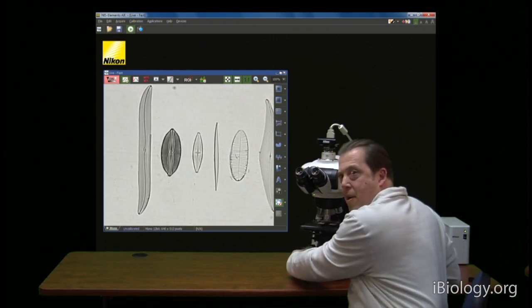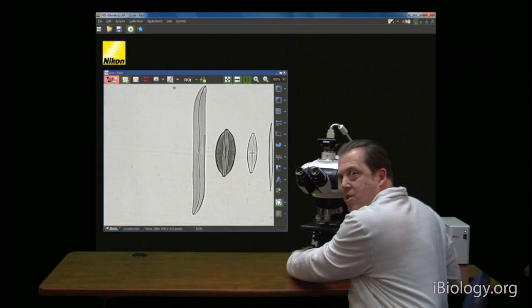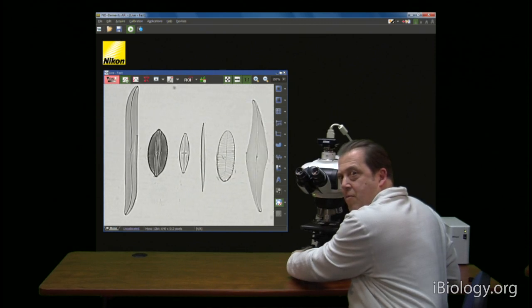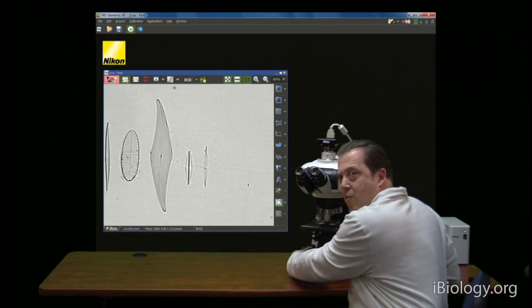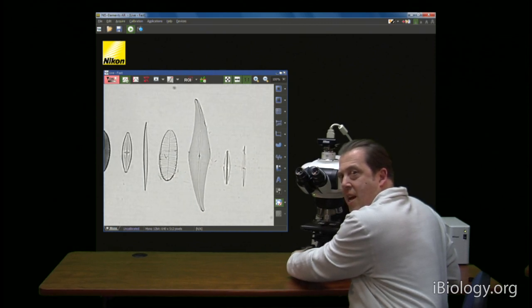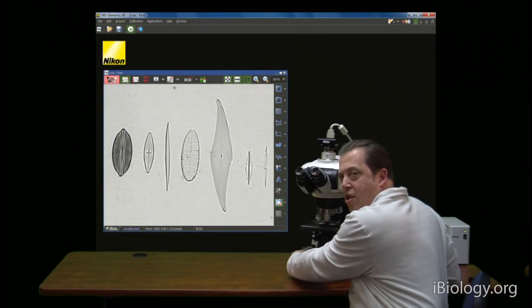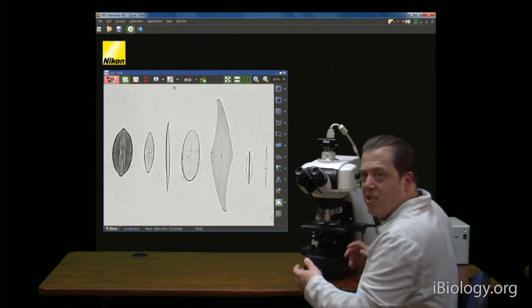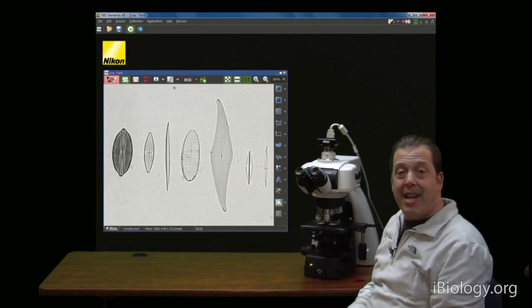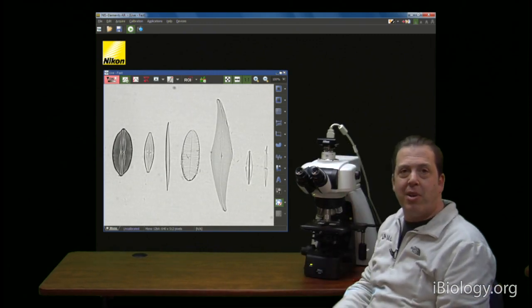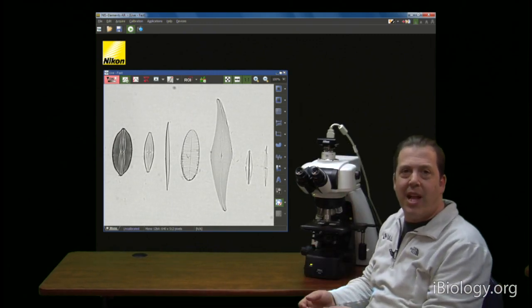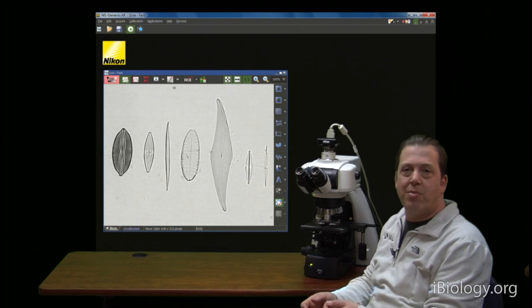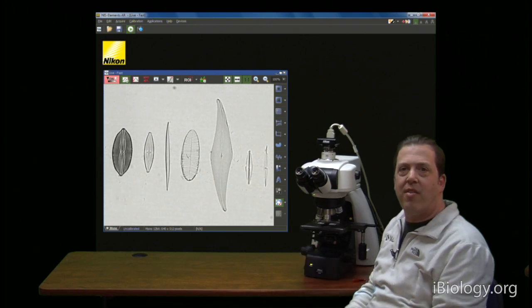And now when we go back to focus, you can see that we've really eliminated most of the dirt. Again, you would want to use something that's not going to damage the specimen, like a piece of lens tissue and some solvent to clean it further.